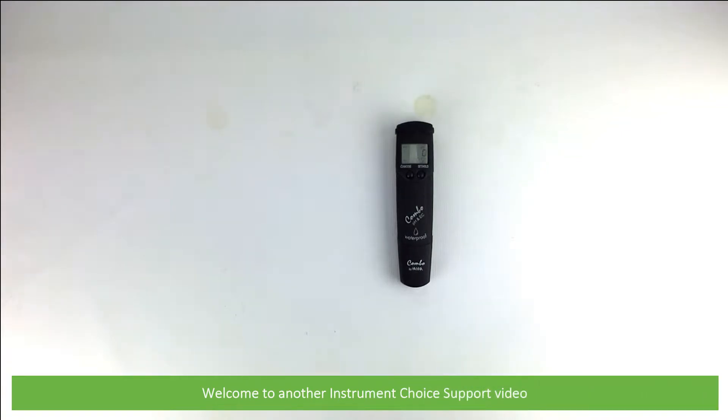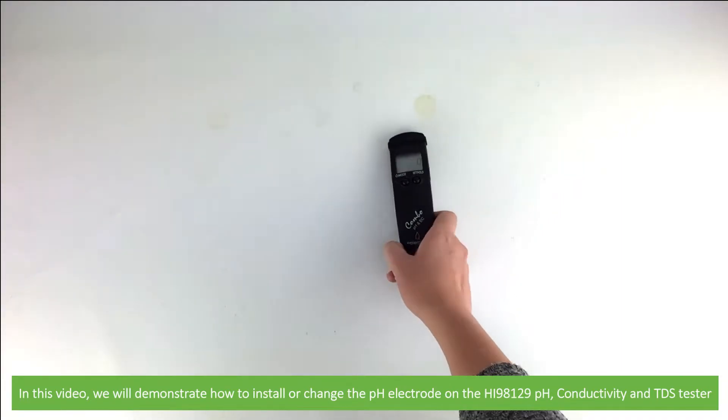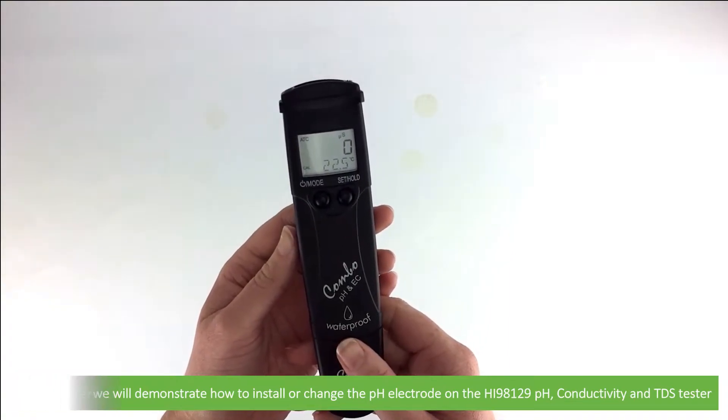Hi and welcome to another Instrument Choice support video. In this video we'll demonstrate how to install or change the pH electrode on the HI98129 pH conductivity and TDS tester.